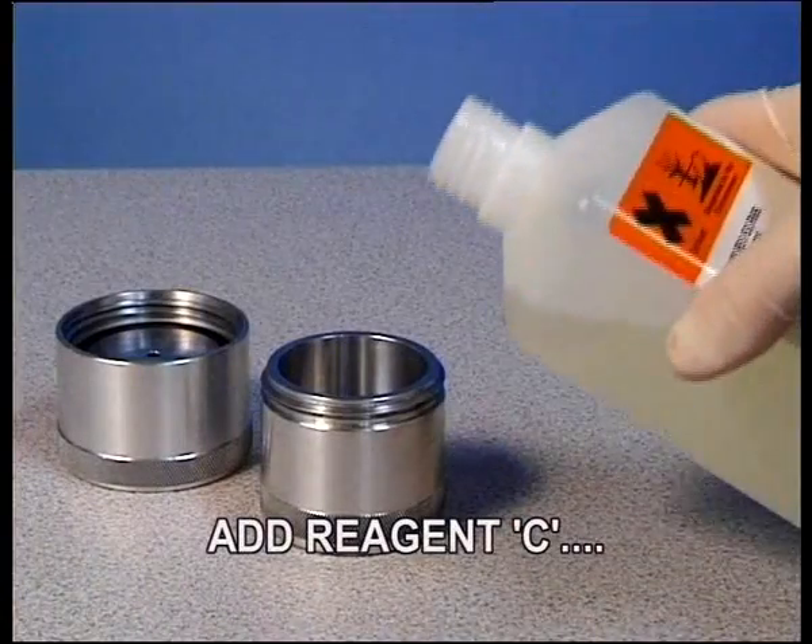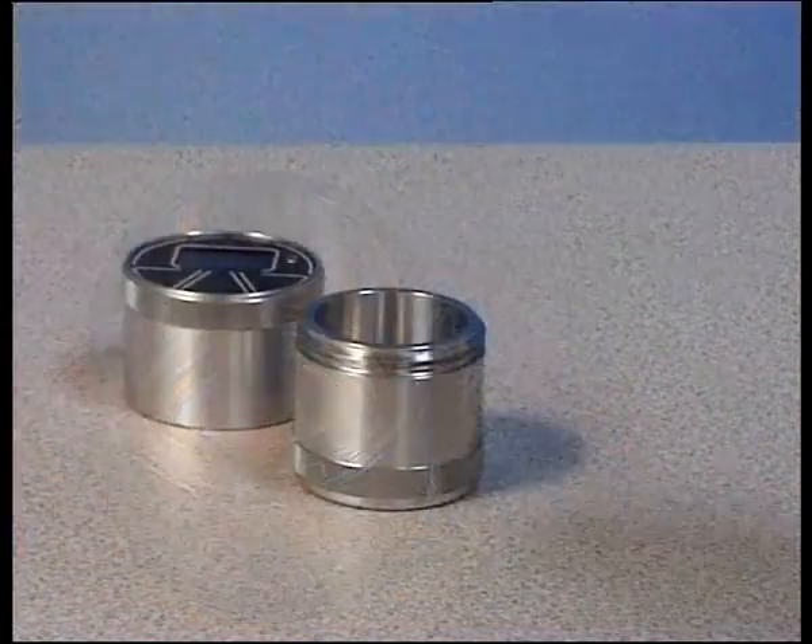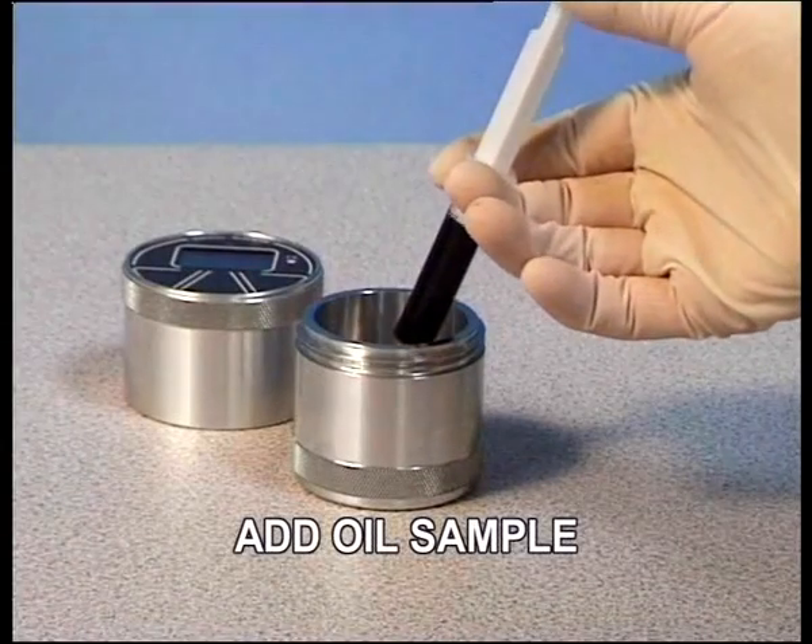Wearing your gloves, add Reagent C up to the lower line. Add the required amount of oil sample.